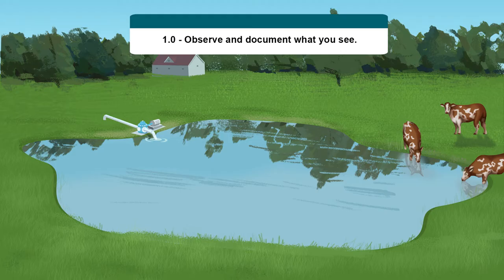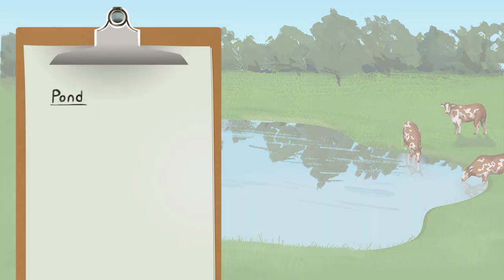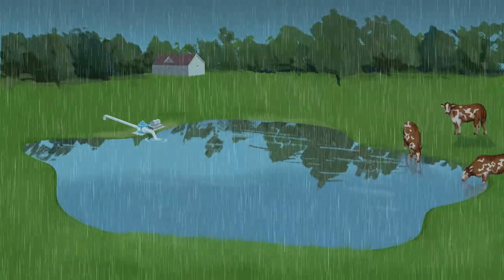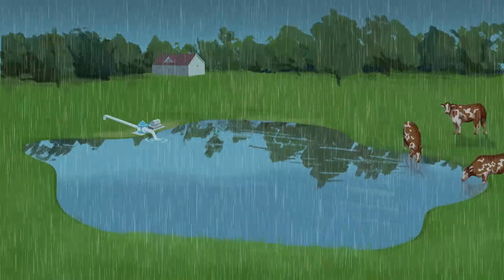Step 1: At the collection site, we'll make observations and document what we see. Note any animals that you see, the kinds of plants in the area, and the stability of the pond or stream bank. Record the day's weather. If it's raining, come back another day. Any precipitation can alter the results from the water.